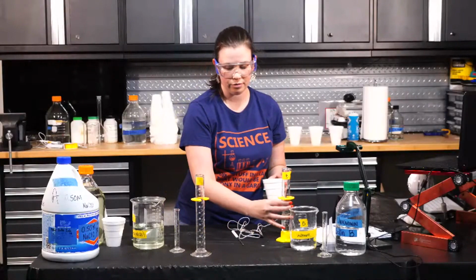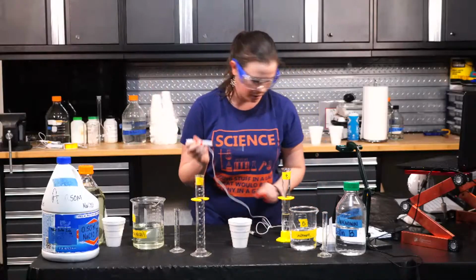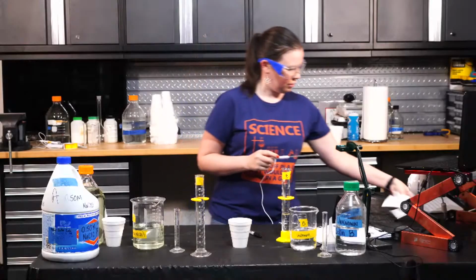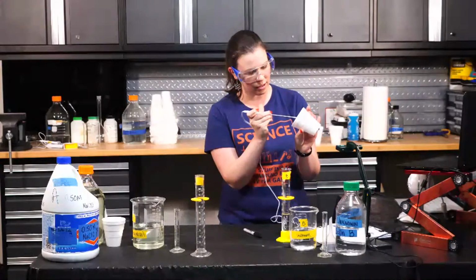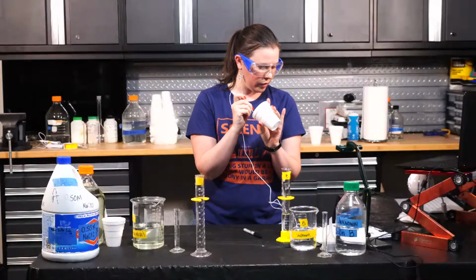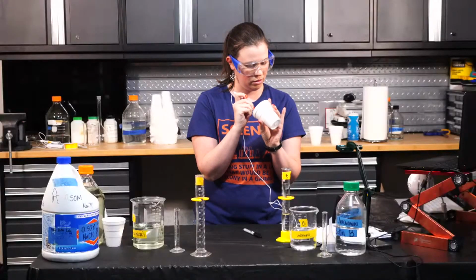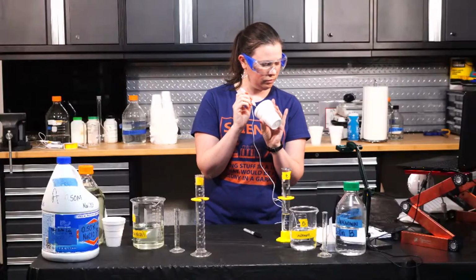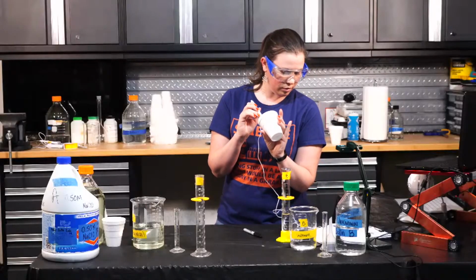Oh, wow. Sorry. Almost did a bad thing. Didn't mix yet. So let me get my initial temperature. Clear this off, make sure there's nothing on it. And there's not a whole lot to dip it in. So I'm going to try to gather it off to the side, kind of tilt it, so that there's enough to submerge the probe of the thermometer. And so we can get our initial temperature here. It says 19.7, which doesn't seem right to me.